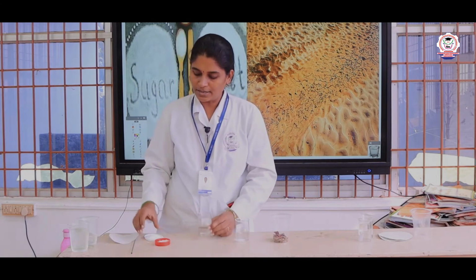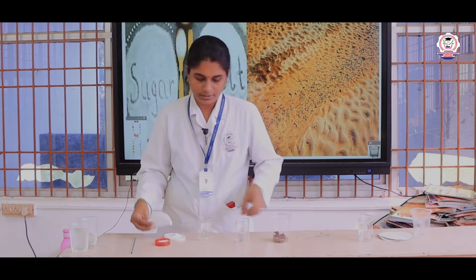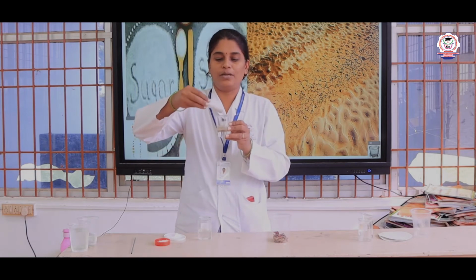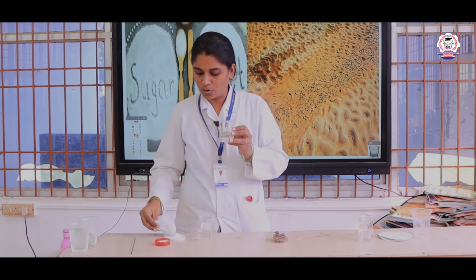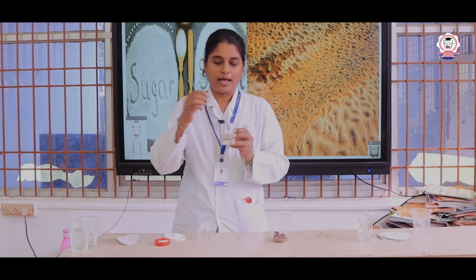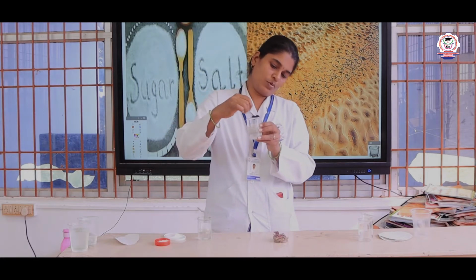Now, again I am taking salt. I am adding a little bit of salt into the next beaker, and again I am mixing this salt with the water.